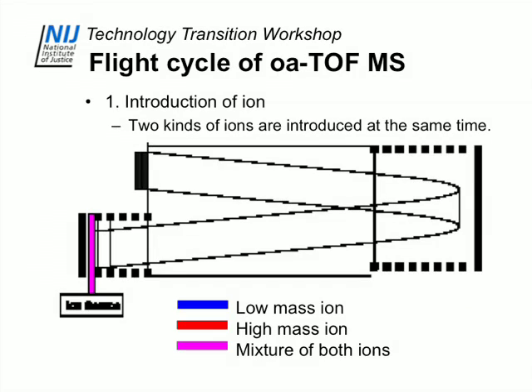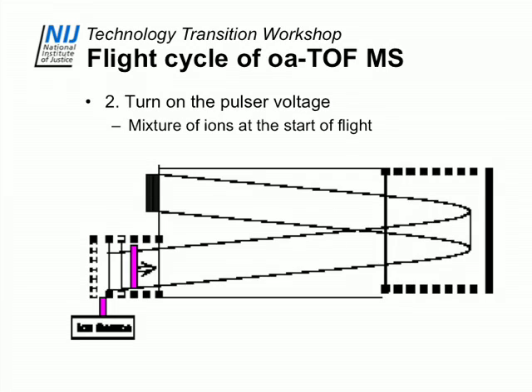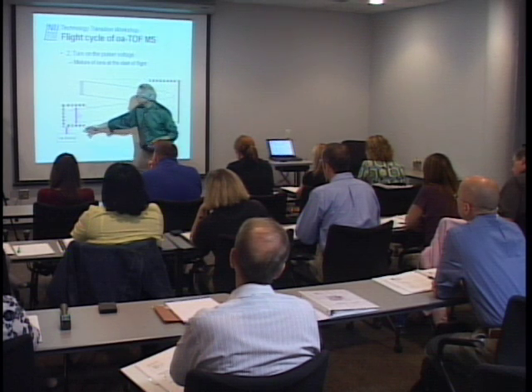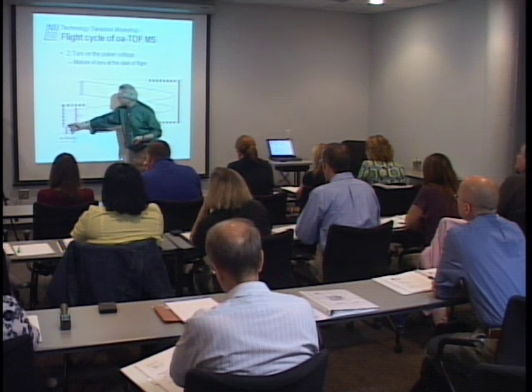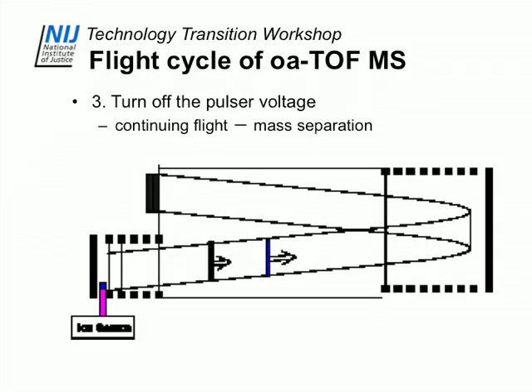Here's an animation of sorts. Watch, we'll go through this once or twice. We're going to bring the ions in orthogonally. This whole thing's turned on its side. But then you can watch them being separated and bouncing into the reflectron. So they go through the ion source. They pass a grid. And as they enter here, you shut the voltage behind this and start filling up this region again. These ions get a kick that moves them into the flight tube.